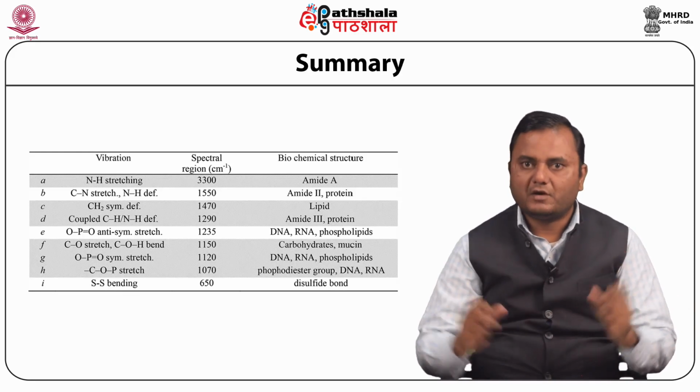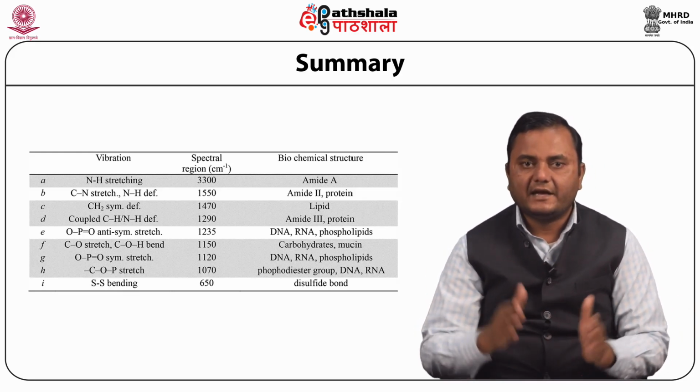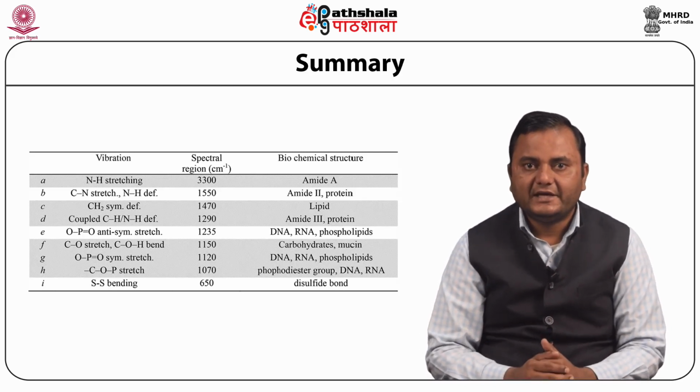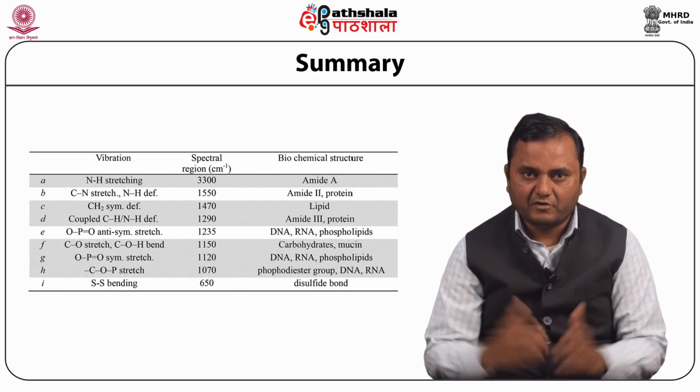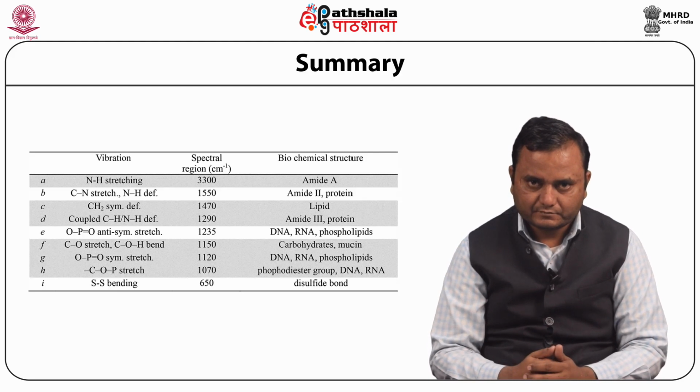And the amide 2 band in the protein, because of the NH group, like the CN stretching and NH deformation, is found in the spectral region of 1550.